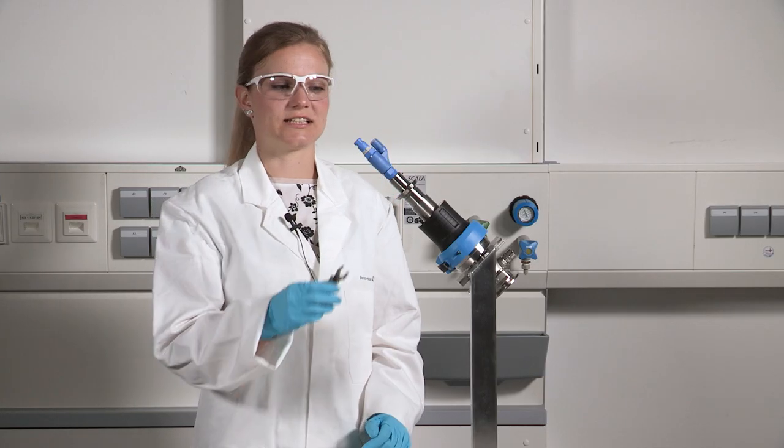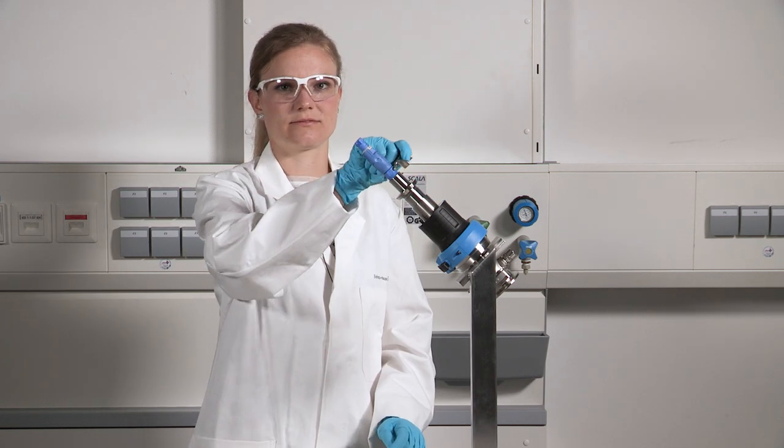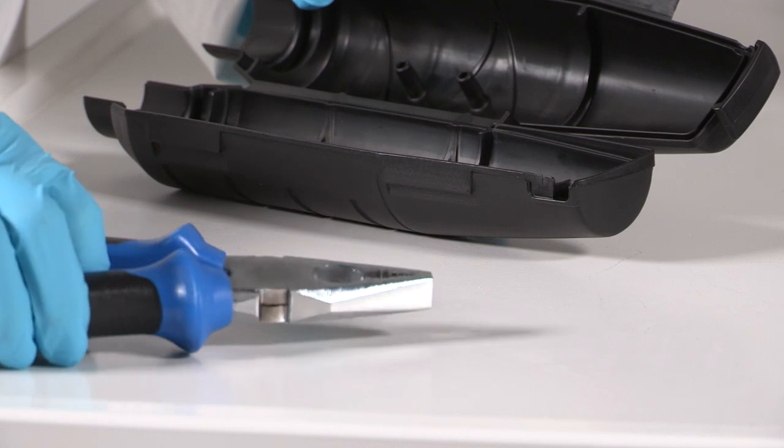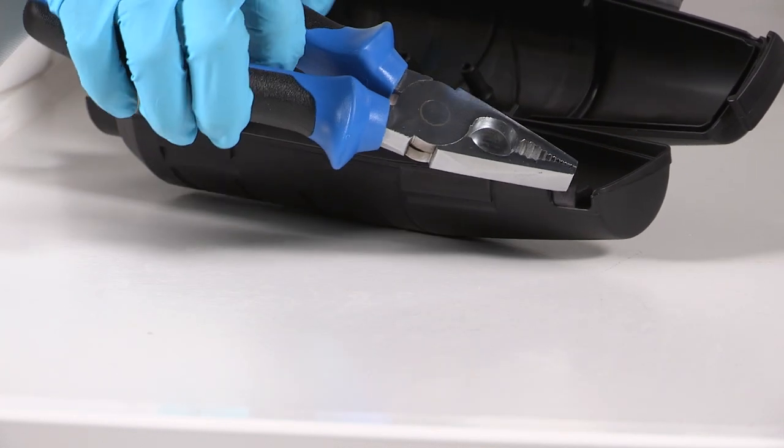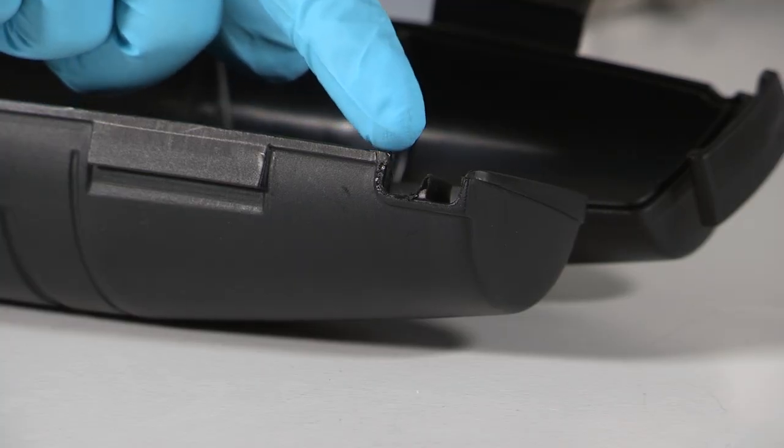The sensor can be screwed in directly without removing the retraction pipe. Use the universal pliers to create an opening for the KCL supply hose at the predetermined breaking point of the protection cover.